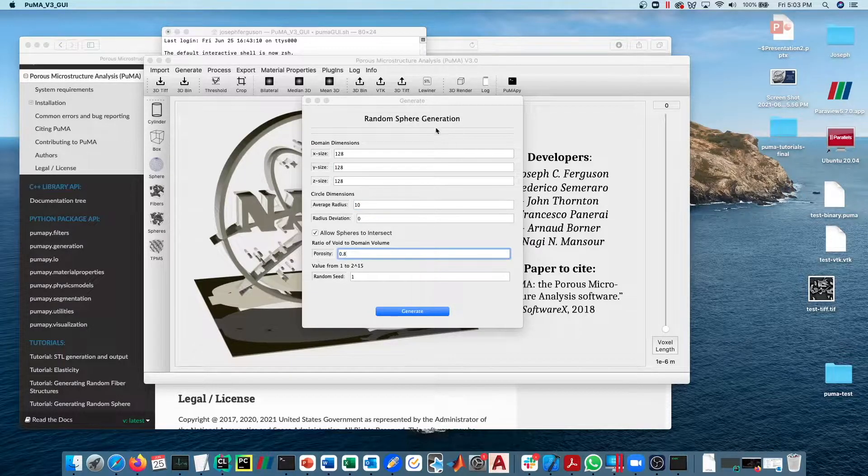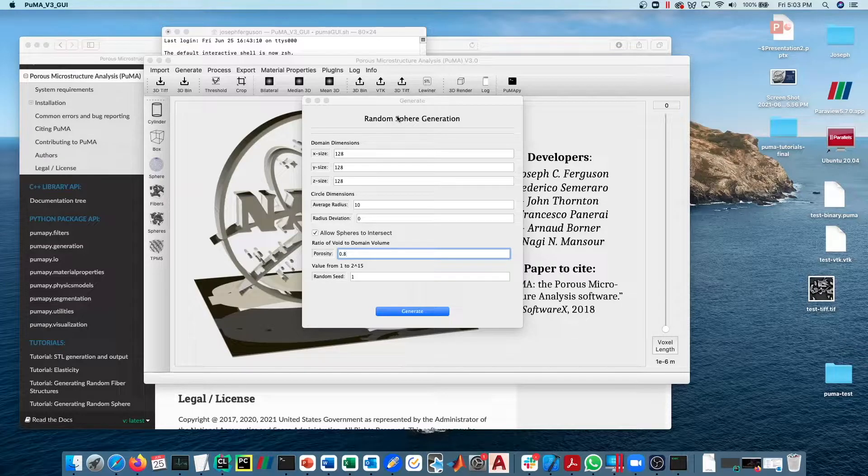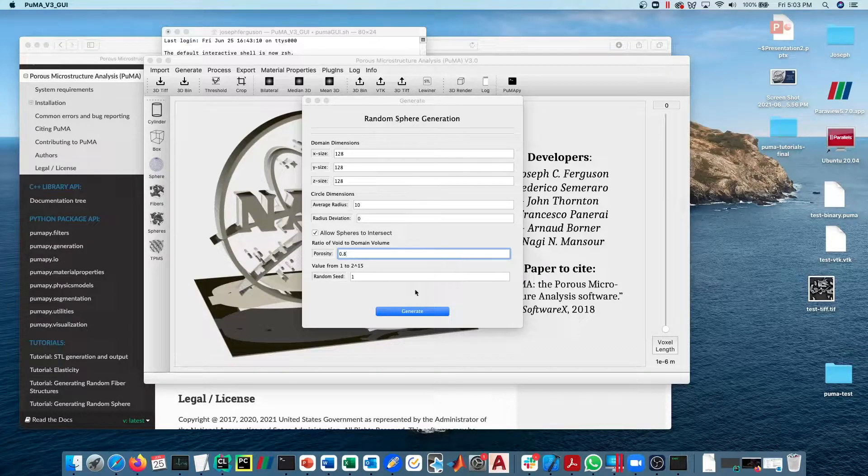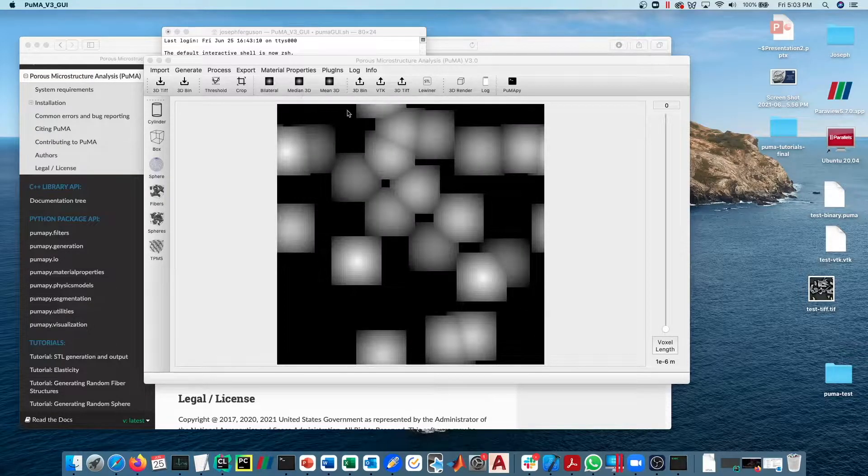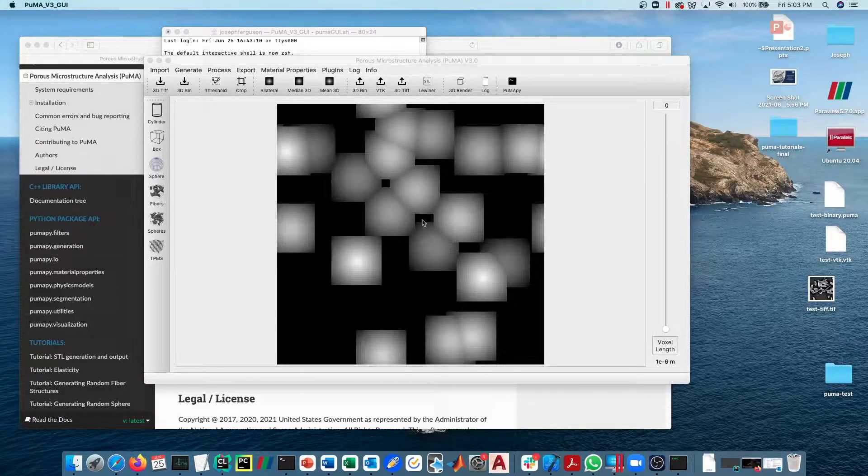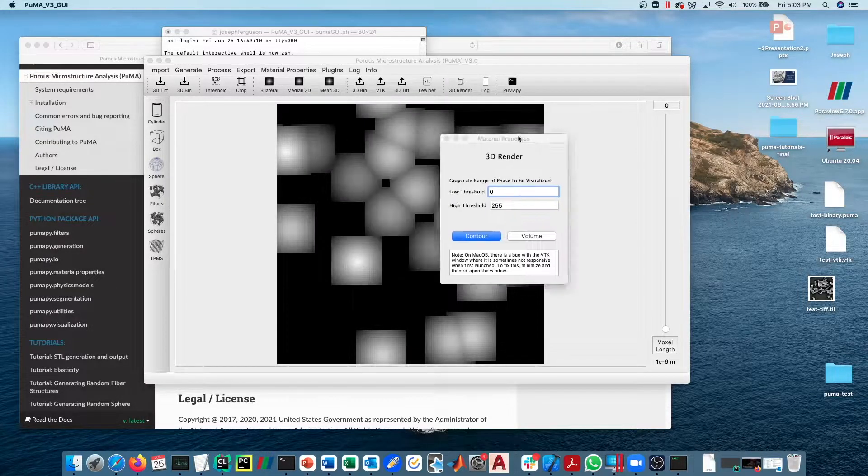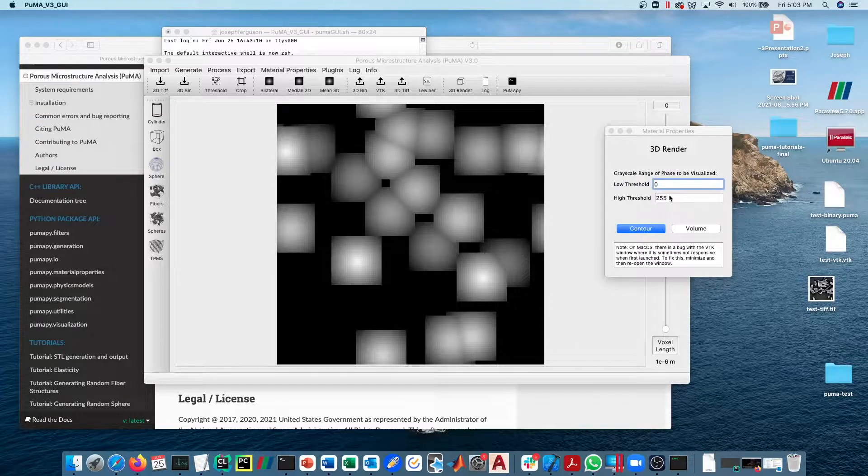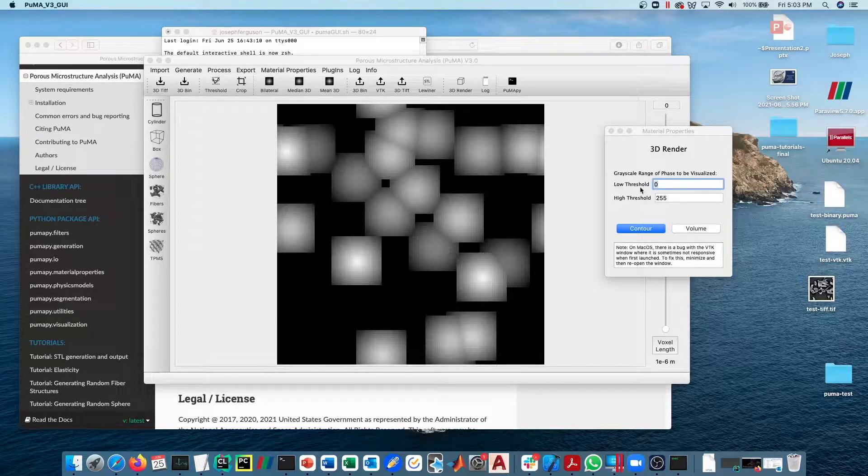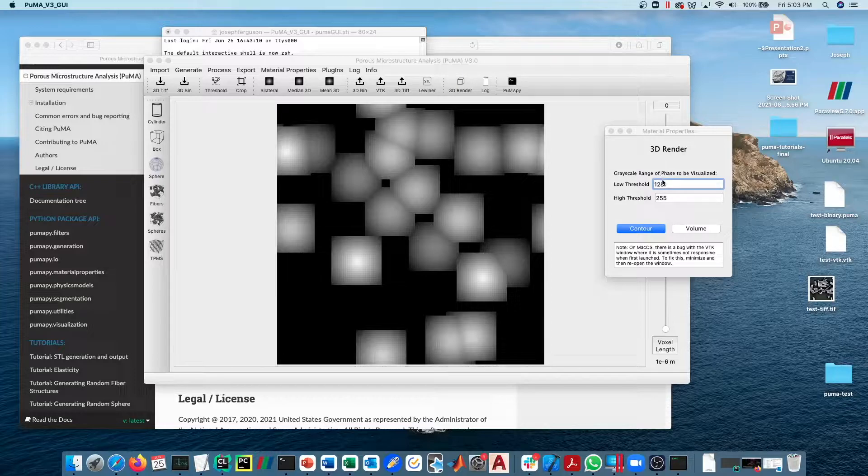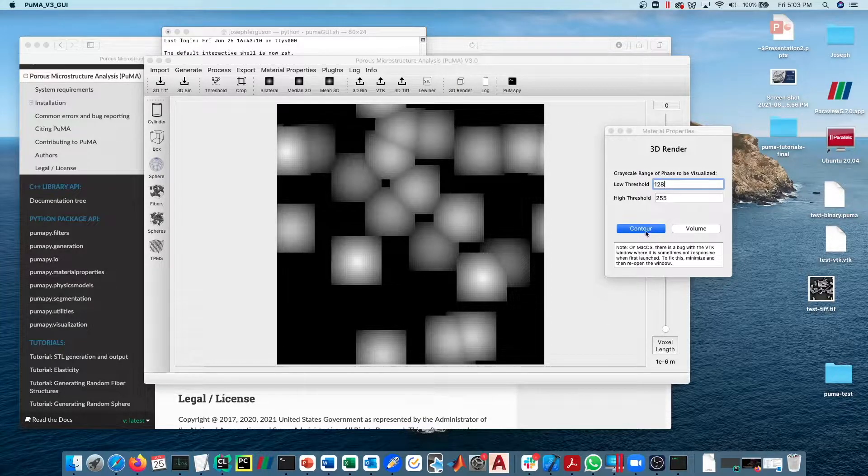There's a separate video that goes through the random sphere generation in more detail. As we go through in that video, the void phase will be stored between 0 to 127 and the solid phase will be stored between 128 and 255 in the grayscale value.